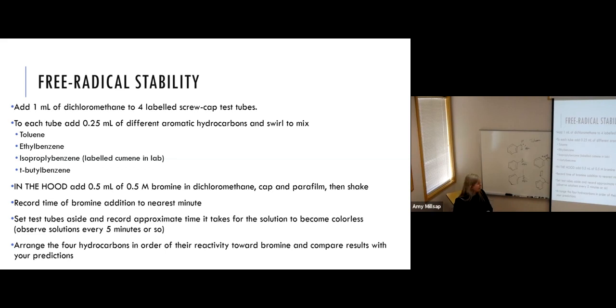Recording the time of the bromine addition? To the nearest minute. You're adding it dropwise, right? In the hood, add 0.5 milliliters. So you're in the hood, you have all your 4 test tubes there. You add 0.5, 0.5, 0.5, 0.5. That takes maybe 30 seconds.